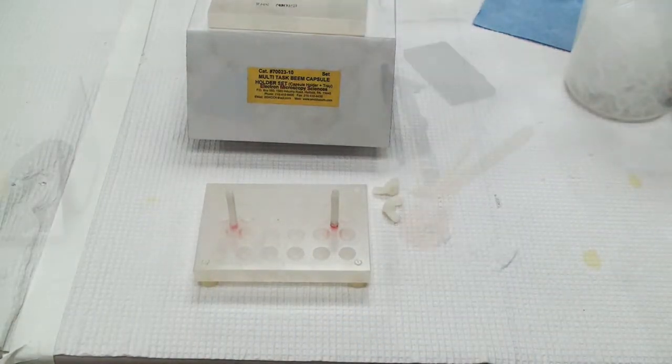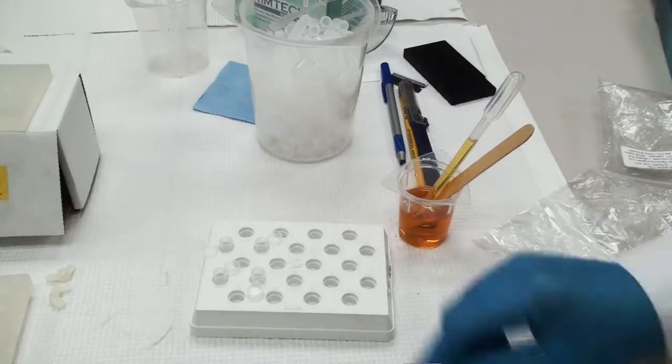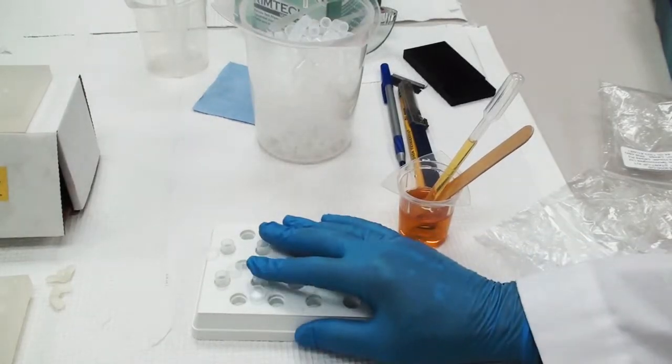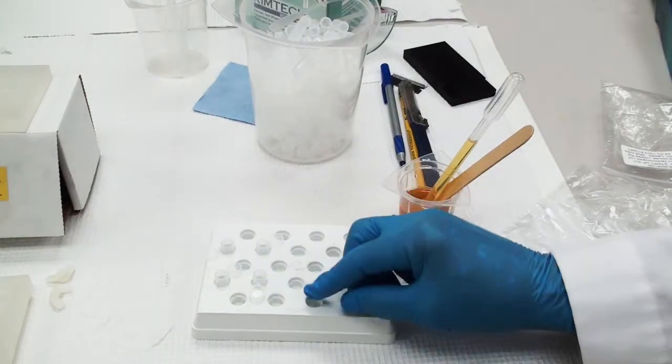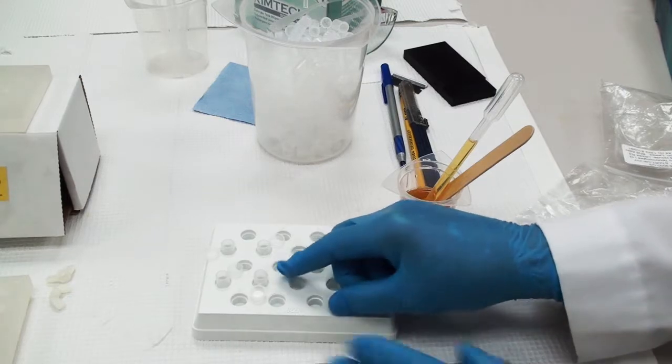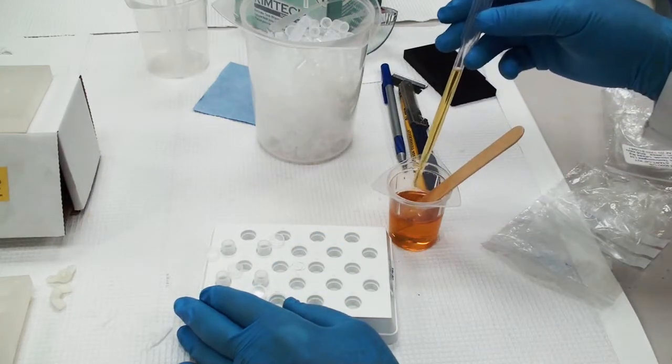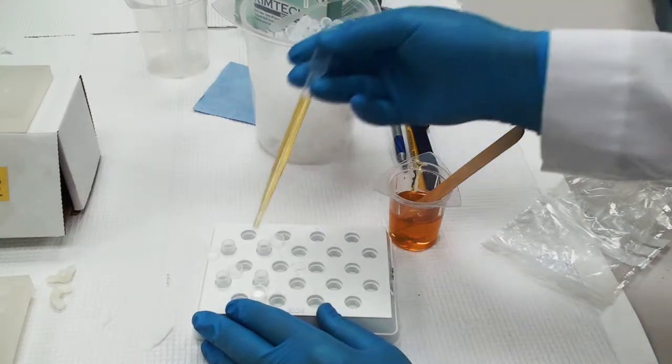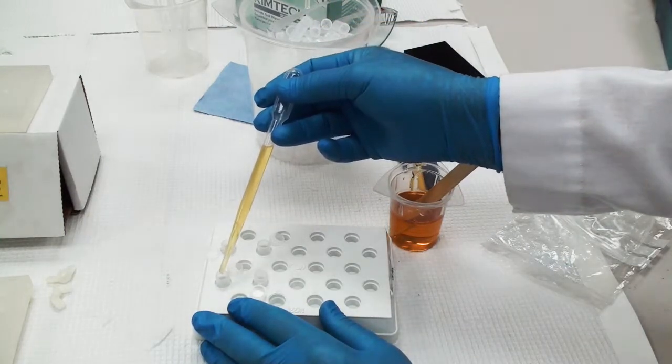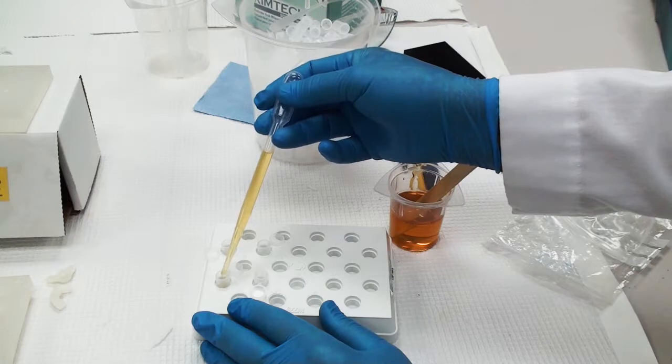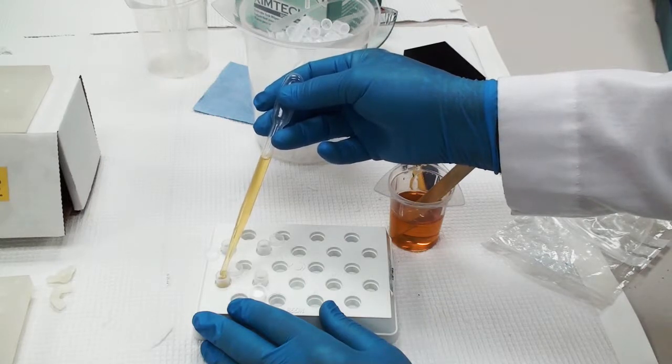I like to start with my beam capsules in the regular holder so I don't get any resin on the insertion of the multi-task. When I fill these up, I want to be sure, like normal, we don't get bubbles in there, typical for even oven polymerization.